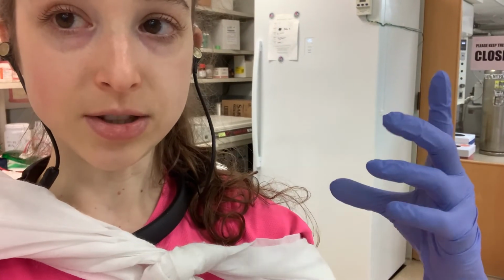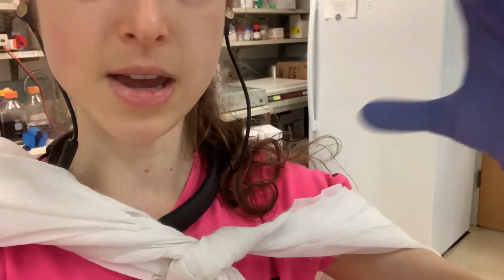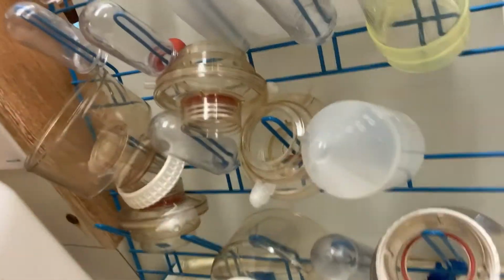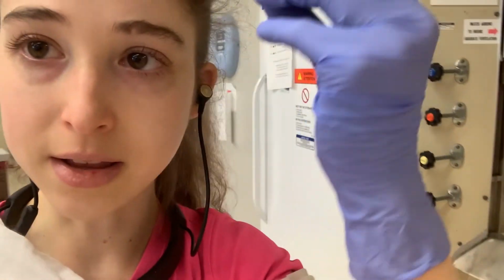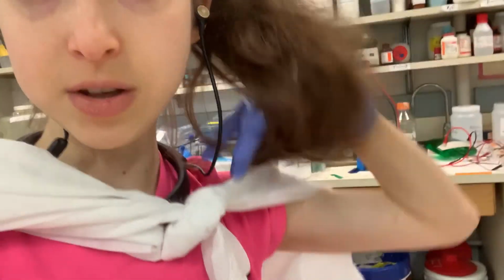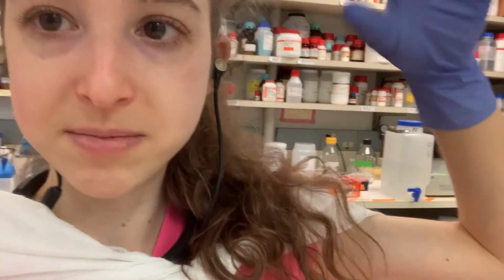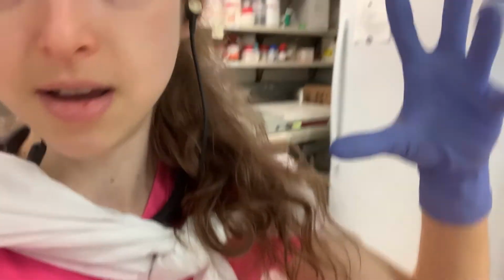And then typically what I do is I vacuum filter the solutions into a bottle. So I've showed you that in a past post, where we have these contraptions that we can stick on top of a bottle, and then there's a filter and you put it through. Because when you're making a buffer, you want this to be stable for a long time when you're making a stock solution, or even if you're not making a stock solution, you still want your buffers to be stable. So you want to filter out any contaminants that are going to mess you up.